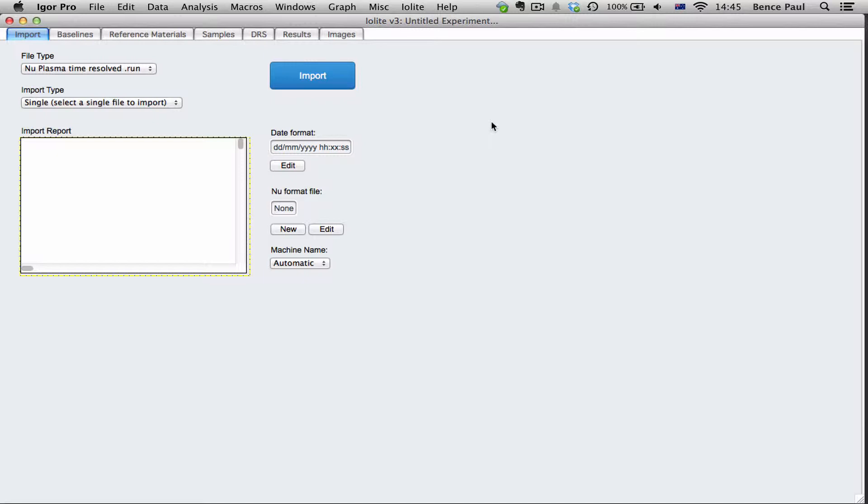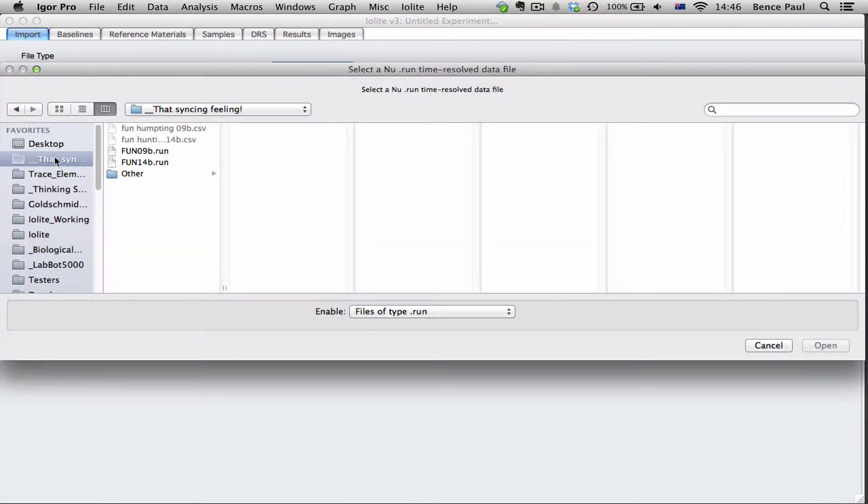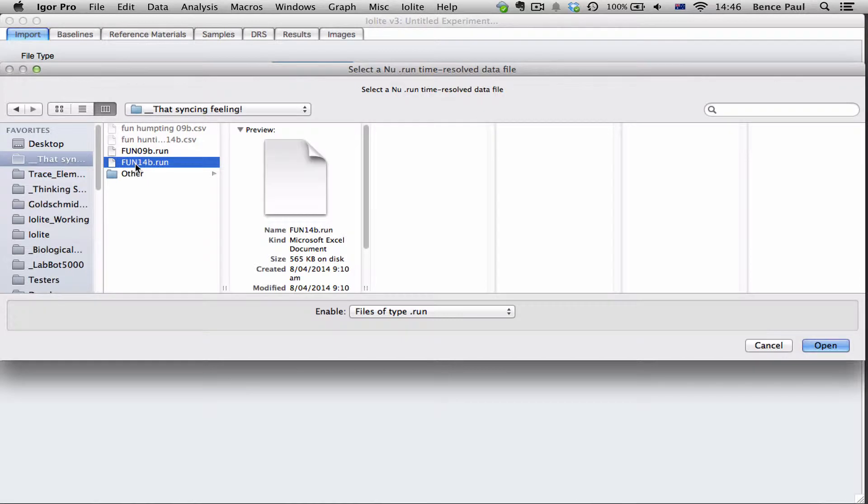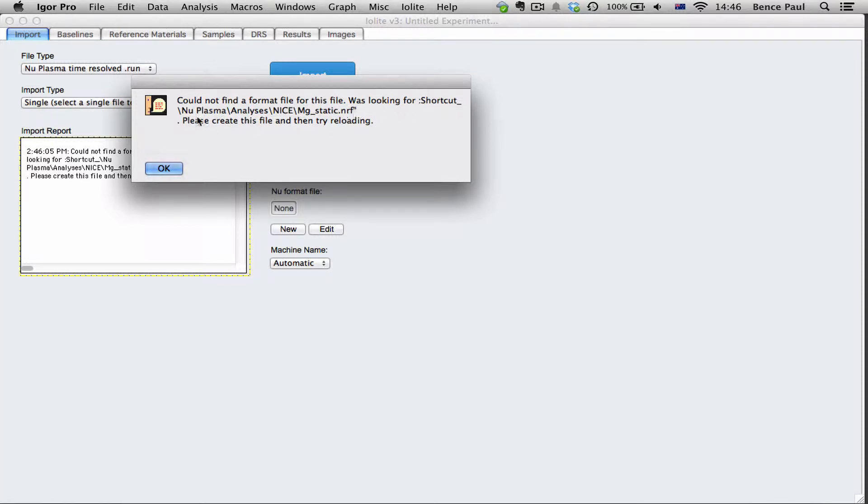So let's see what happens if you try to import a .run file before creating your format file. I'm just going to load up a .run file and we can see that it says could not find the format file for this file. It's looking for this particular one. Please create this file and then try reloading.